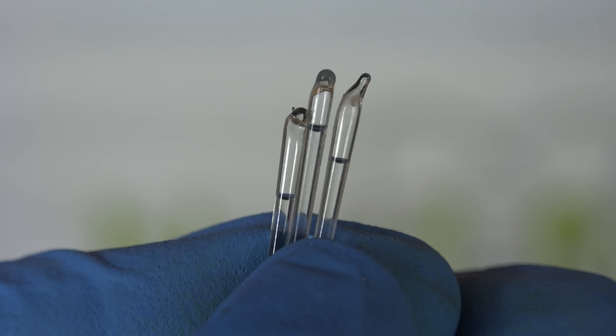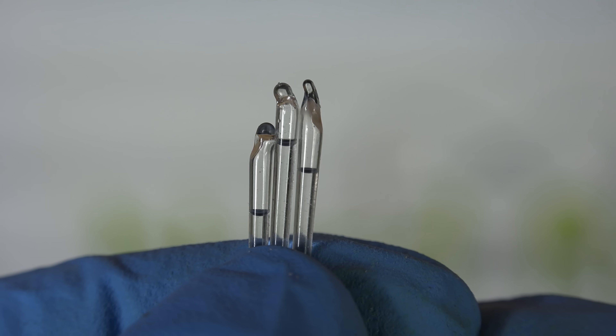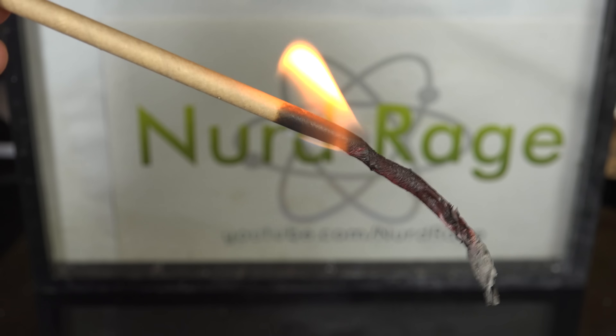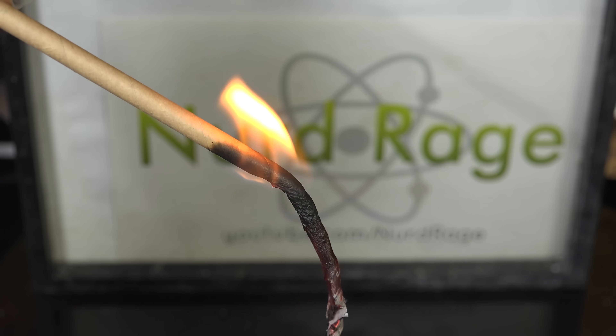They worked by having a capsule of sulfuric acid coated in a potassium chlorate and fuel mixture inside a paper tube. You just crush the capsule and the sulfuric acid reacts with the potassium chlorate fuel mixture and ignites it. I am going to make them in this video.